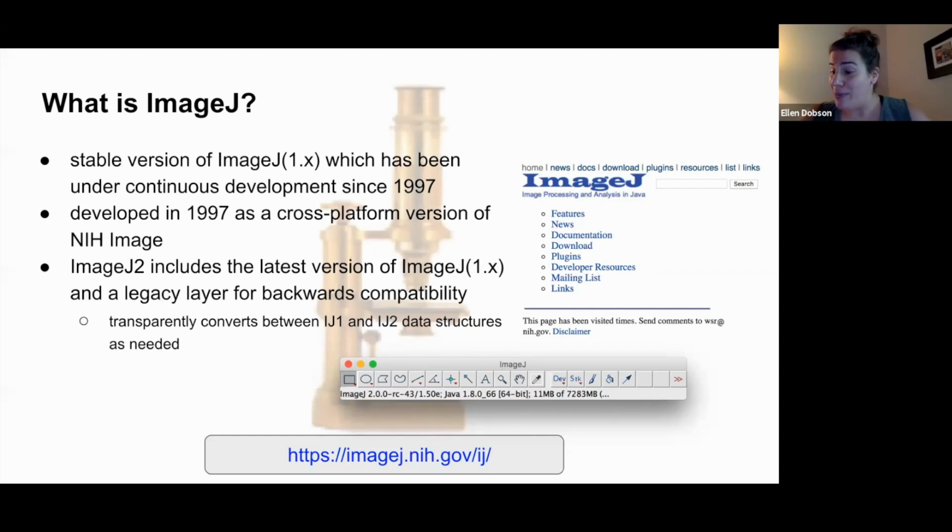Well, it does matter because our group at Madison basically rebuilt the architecture of ImageJ under the hood to bring it up to date, and that's our ImageJ2. For example, ImageJ1 can only handle 5-dimensional data sets, and now with ImageJ2, with the updates, we can handle multidimensional, newer imaging modalities like light sheet microscopes and so on.